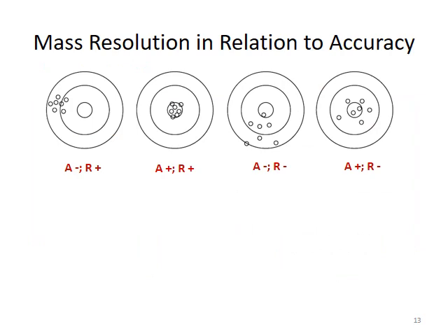You have learned mass accuracy and mass resolution. Naturally, you would think if mass resolution is high, the mass accuracy would be good as well. For the majority of cases, this statement should stand true. However, high mass resolution is not always leading to high mass accuracy.